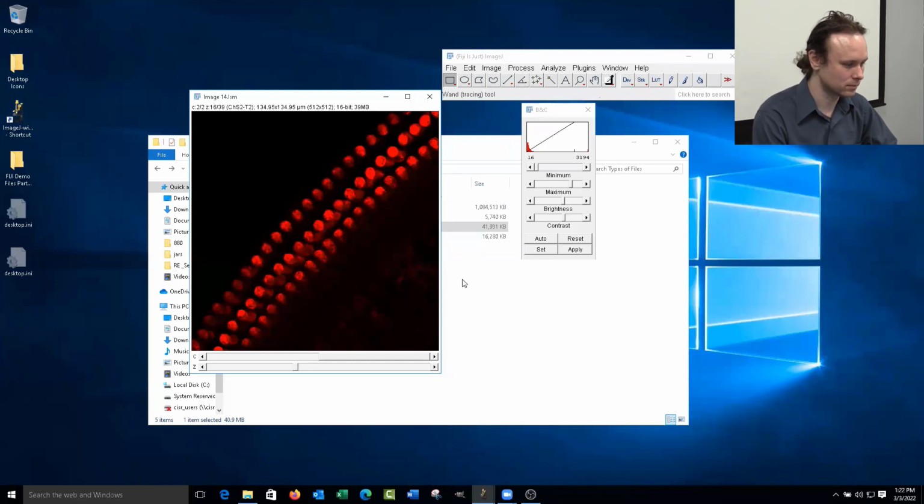Right, and I guess people probably understood this, but to the same question about doing it across your data set, you don't want to pick your min max for green and then apply it to your others. Those need to be chosen separately as well.